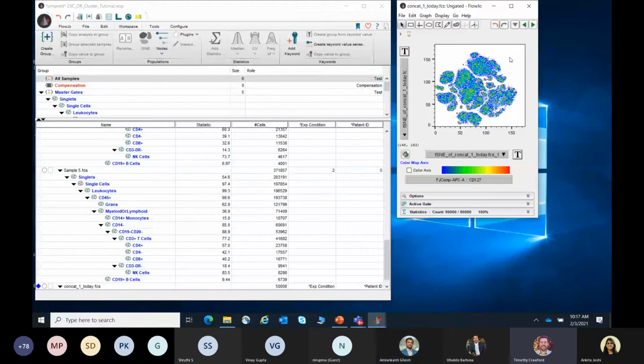Generally, we've chosen settings that work on most data quite well. And so the defaults are usually my go-to when I demonstrate and employ these for real purposes. So don't get overwhelmed with all of the different options within those plugin UIs. It's worth just giving it a go and making sure you get an output, and you'll find that if you apply Flow AI to a really cloggy sample, then you'll see it clean up quite well.